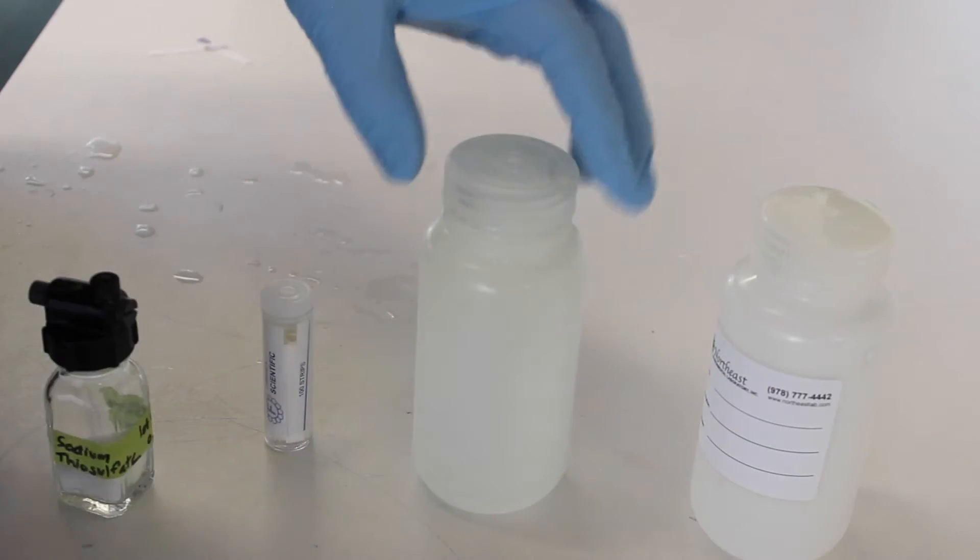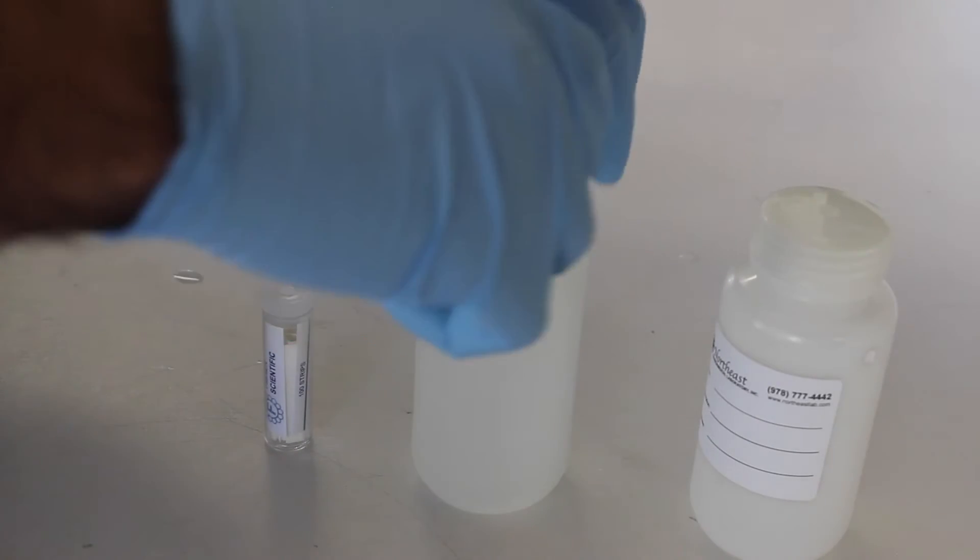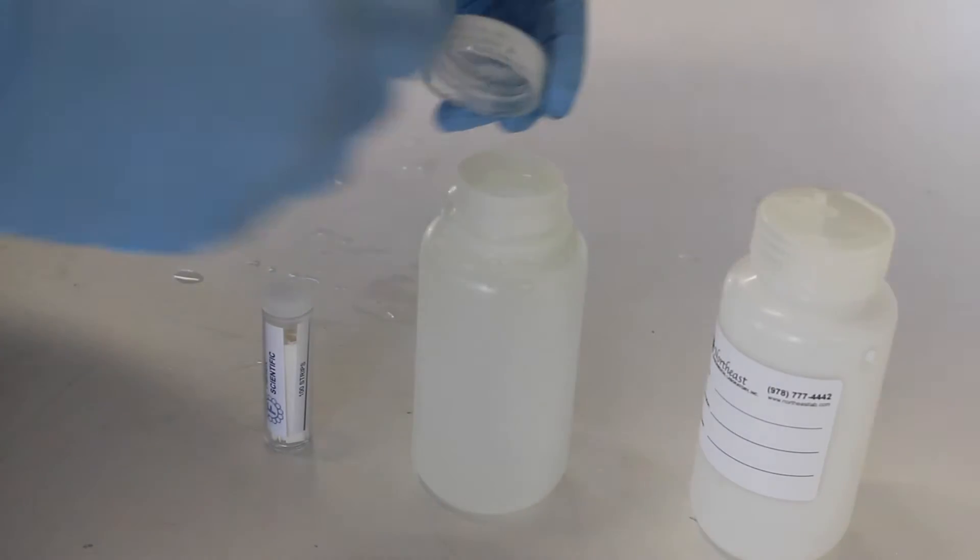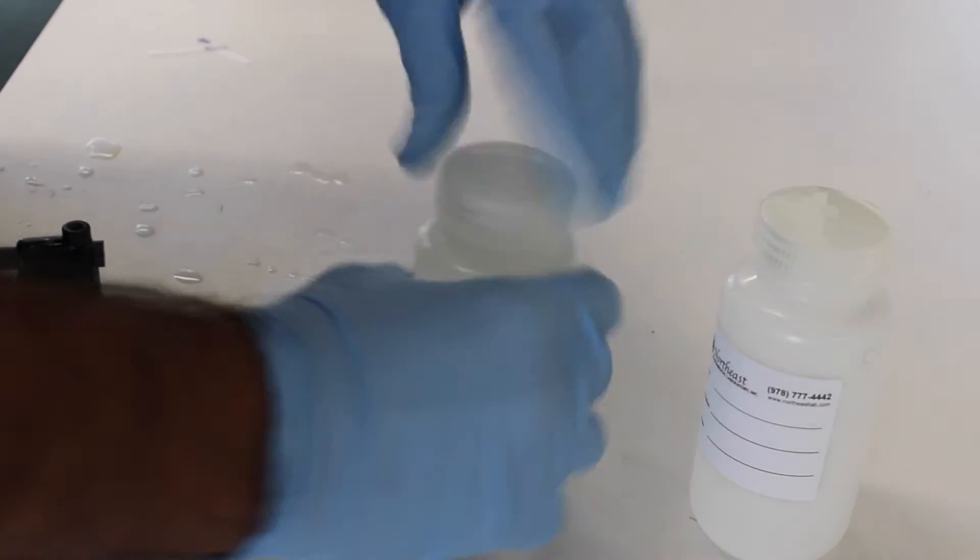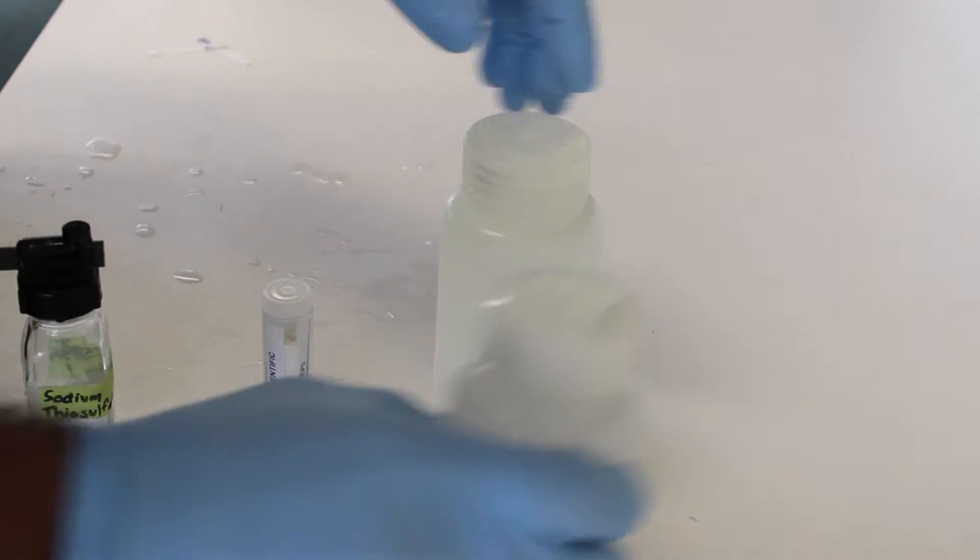At this point, add a final shot of sodium thiosulfate to dissipate any chlorine not detected by the test paper. Mix well and transfer to the sample bottle provided by Northeast Environmental.